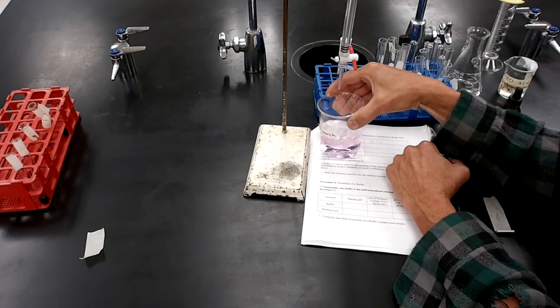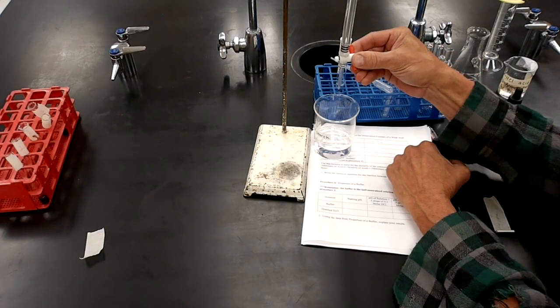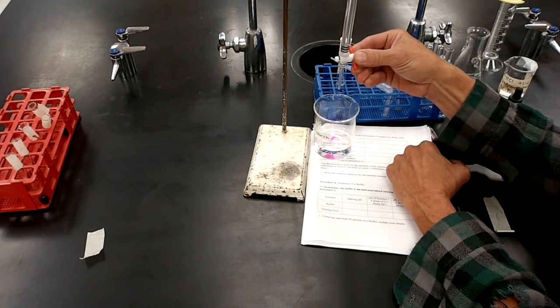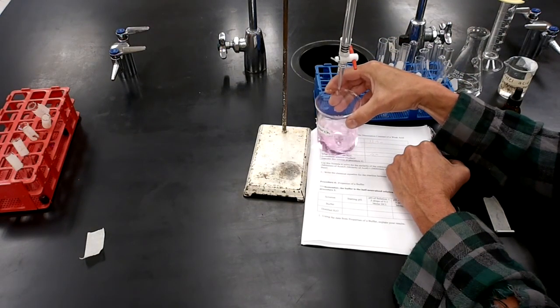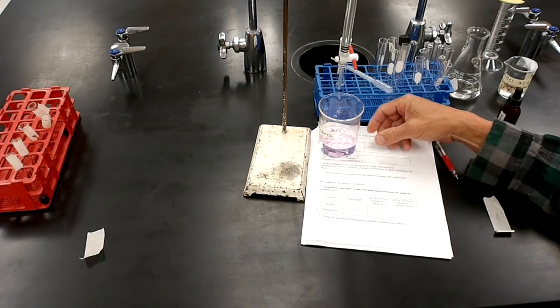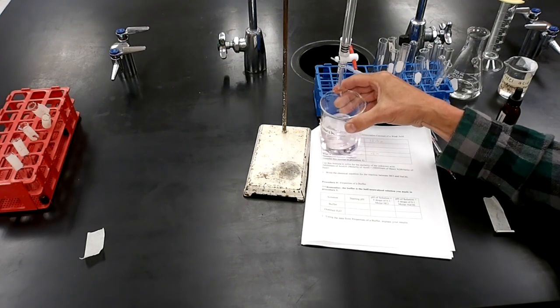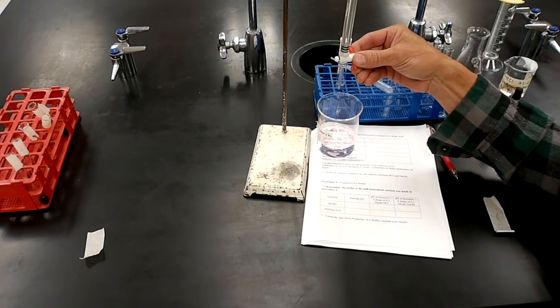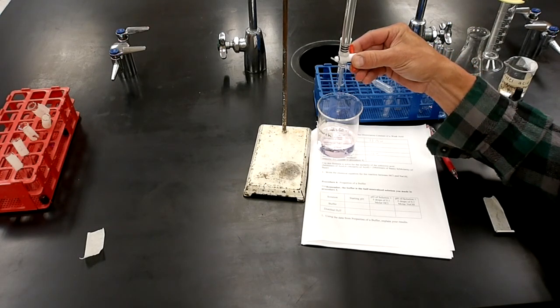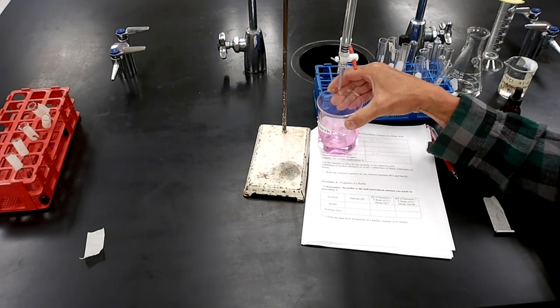And it's just barely pink. And it's cleared up. One more drop. I bet it'll do it. That's about there. I'll put another drop in so it looks a little more obvious. And it's probably going to stay.